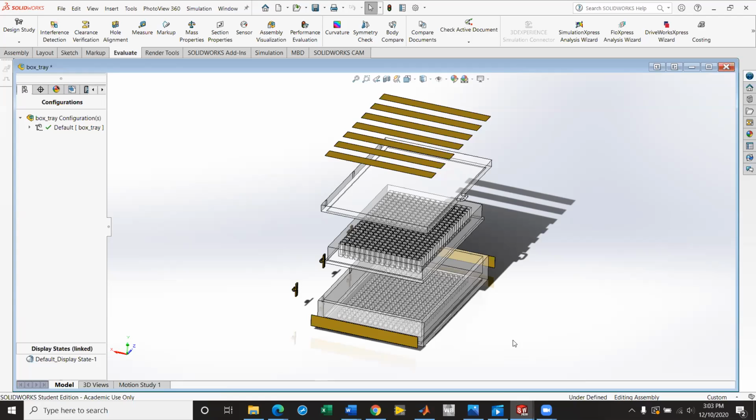I was going to suggest that it might be possible to take readings when the optical readings are going to be taken, the fluorescent lights included in the chamber are going to be off. It's going to be completely dark and closed off from any ambient lighting in the laboratory. So I was going to suggest that it take maybe multiple optical readings from one well plate using individual LEDs, or what Andrew just suggested, multiple LEDs coming on per well plate. But that might be tricky.